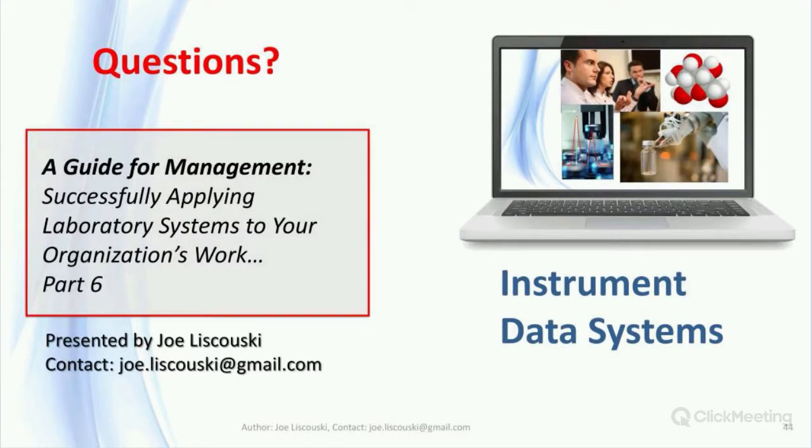If you look at the history of data acquisition and instrument architectures and instrument data systems, the stuff we're working with, the architectures were formulated 20 years ago and haven't changed very much since then. That was the stuff they had. It worked. People are still using it, and nobody's beating on them to change things, to make things work better.